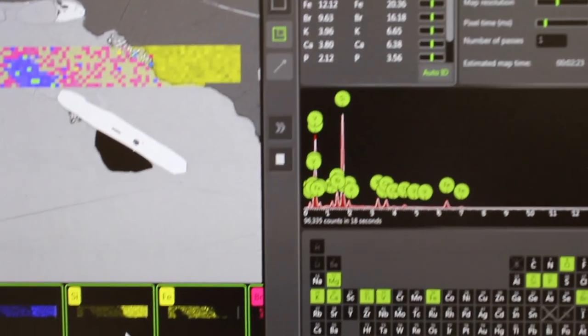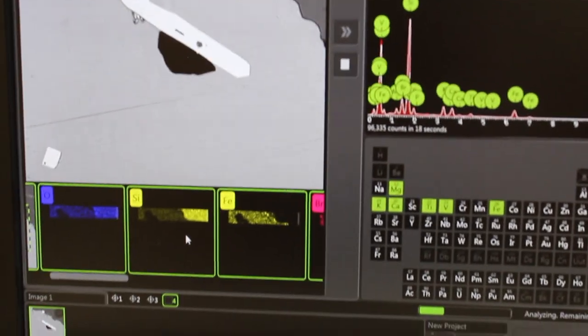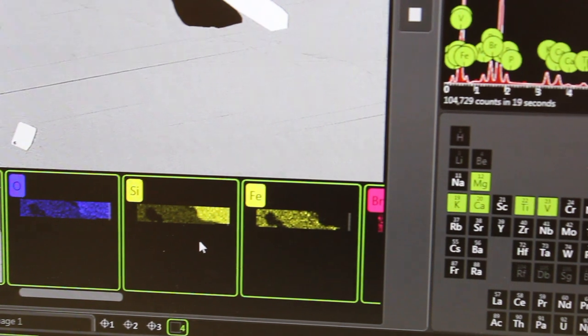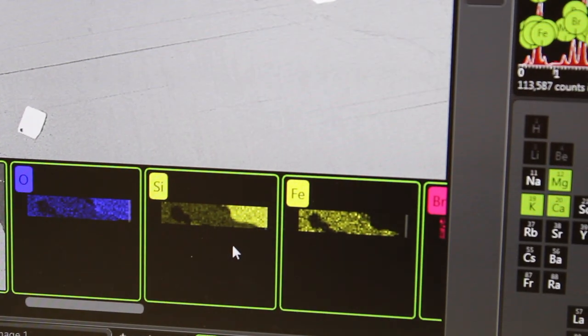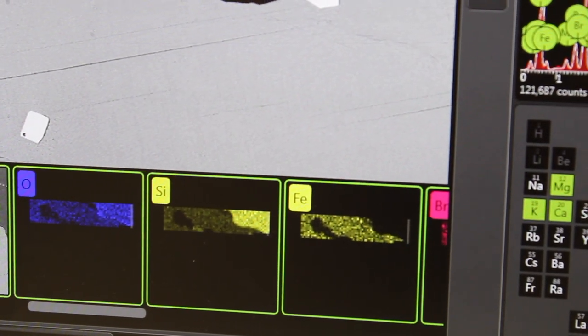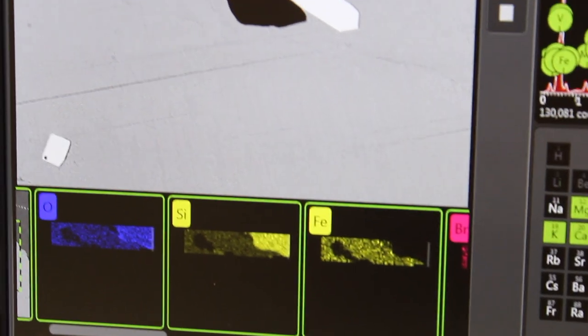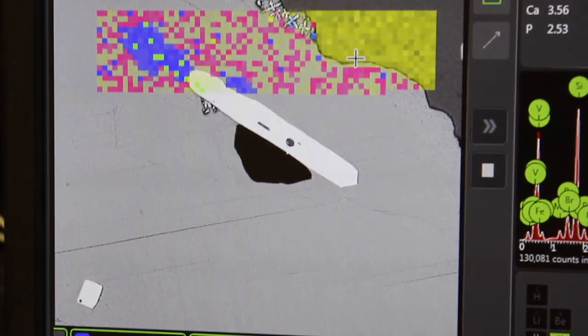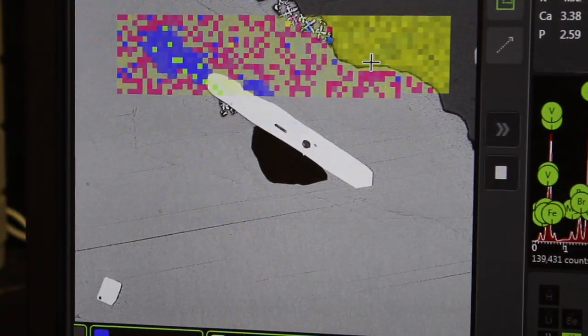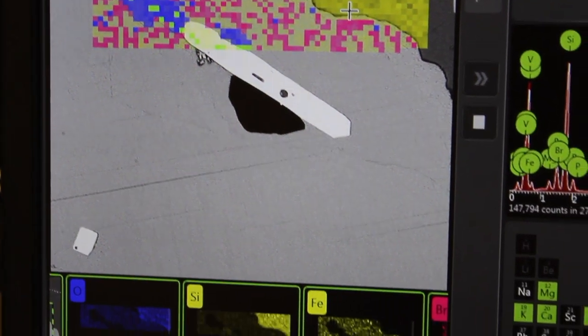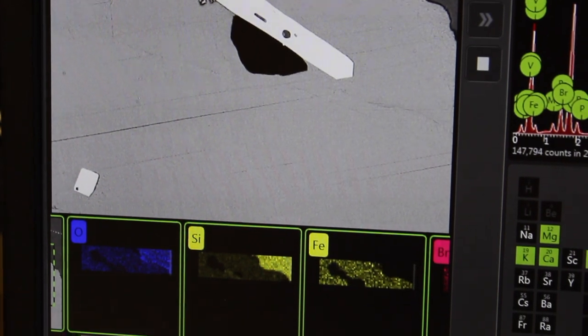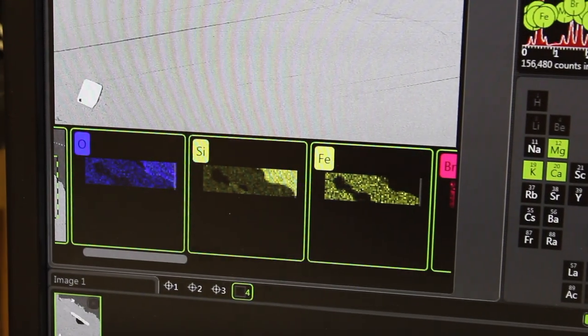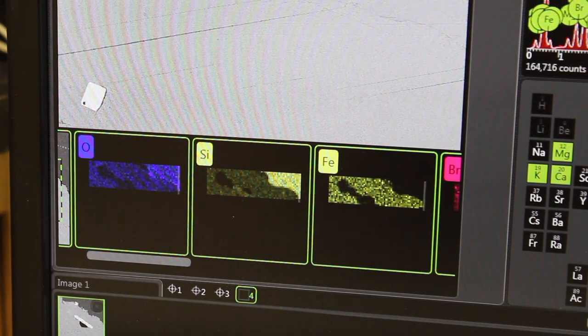As we're going, you can see what elements it's actually mapping here. There's a composite image at the top, so if you decide you don't want to map certain elements, you can unclick them at the bottom here, and then they won't map it.